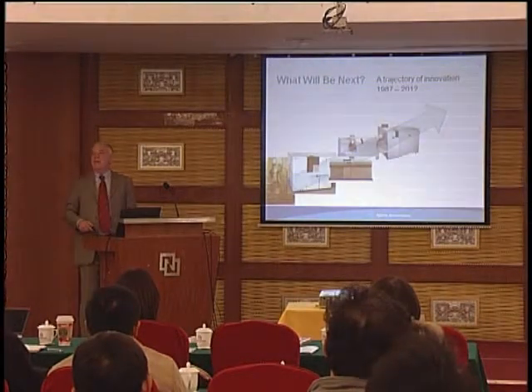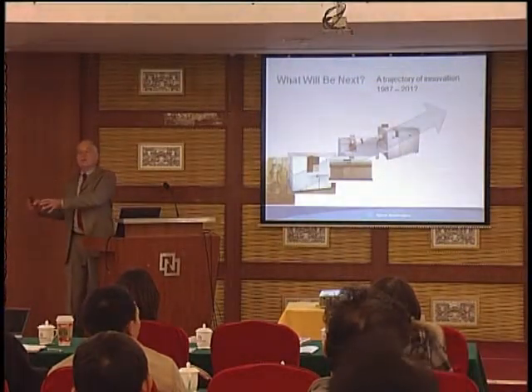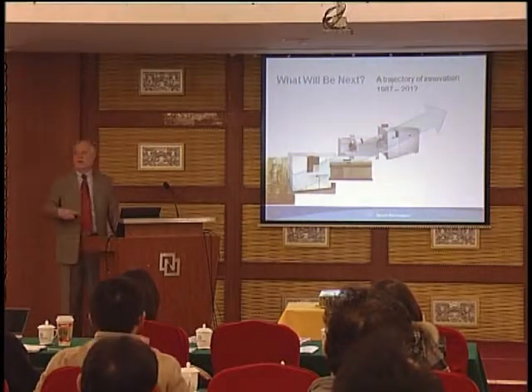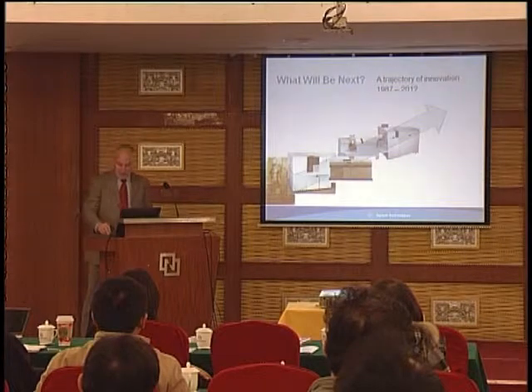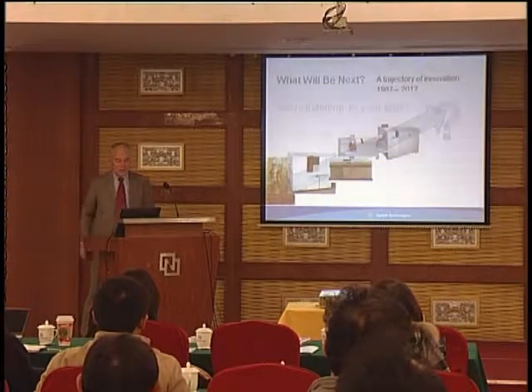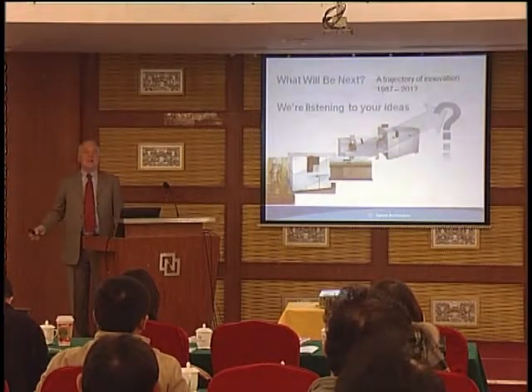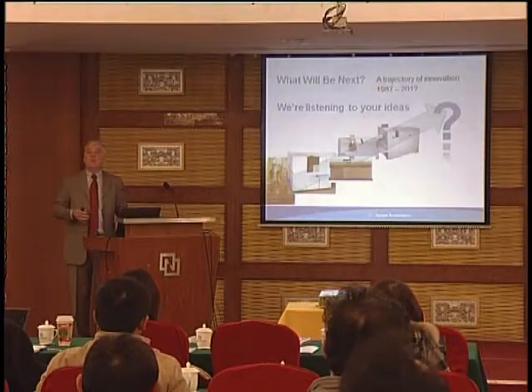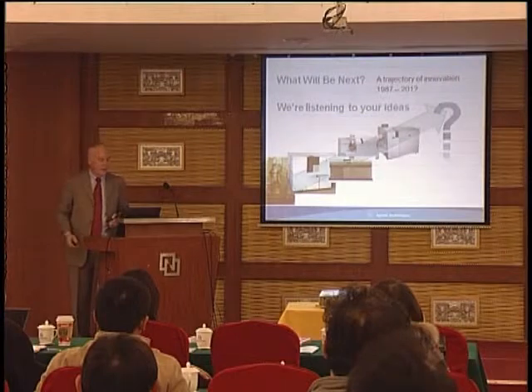So where are we headed? Based on that sort of toolbox of technologies that we've got, what's going to go right here? What will be the next ICP-MS instrument from Agilent? And again, we have ideas, but we want to know what you need. What are your ideas? What are your thoughts?